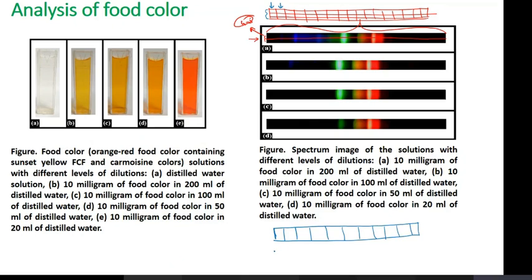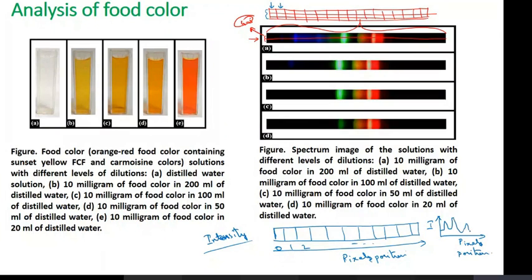Now, what is there in the x-axis? In the x-axis, you have pixels. And what do these pixels have? These pixels have intensity values. Right? So in the x-axis you have pixels, in the y-axis you have intensity values. Now from here we can plot a graph of intensity versus pixels. Pixels mean pixel positions. So the first position will be 0, 1, 2, and in this way it will go on, right? So here also pixel position. So you will be getting the spectrum of the light.